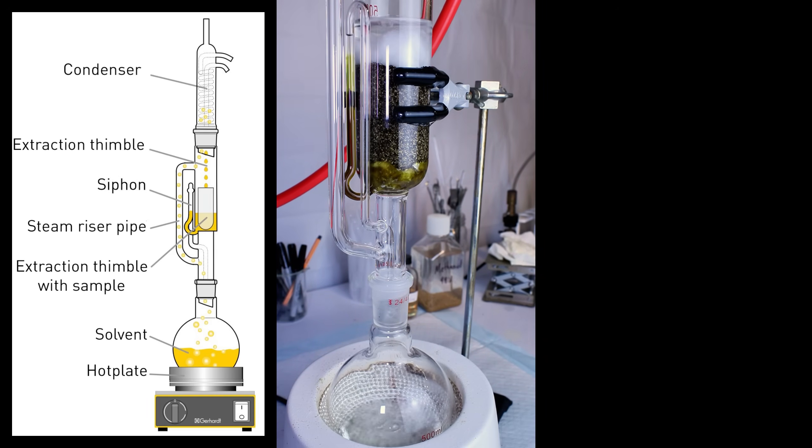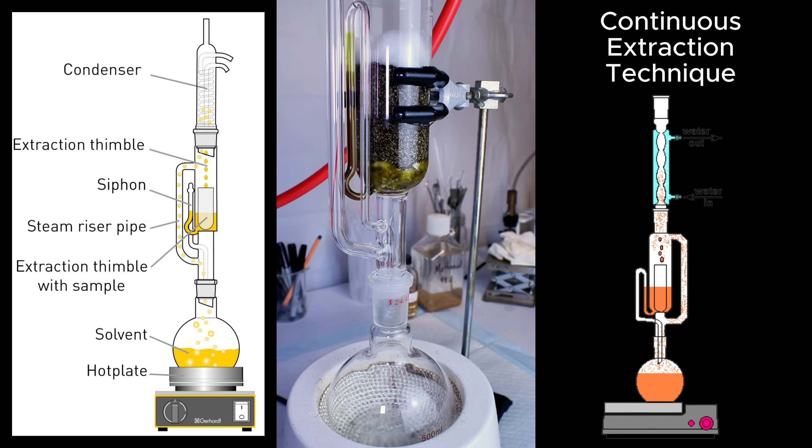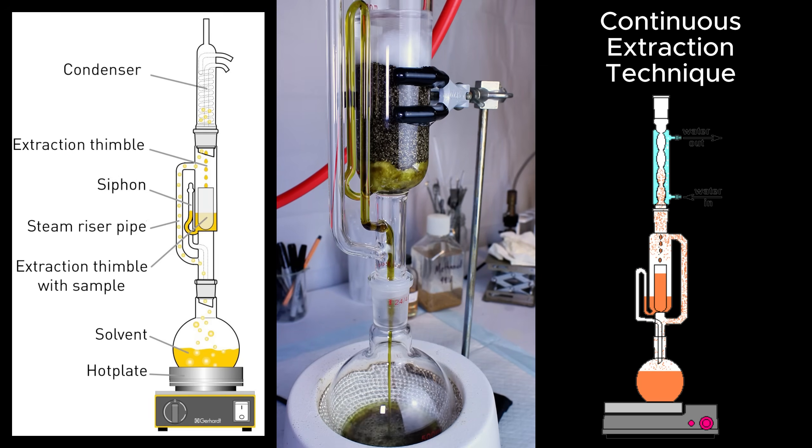At that point, it will immediately start to evaporate again and condense clean isopropyl back on top of the black pepper. This builds until it triggers the siphon again, and the process repeats, which makes this a continuous extraction technique. The cool thing about this process is that due to the fact that black pepper is being continuously rinsed with fresh isopropyl, you can achieve a nearly 100% efficient extraction with a relatively small amount of solvent.